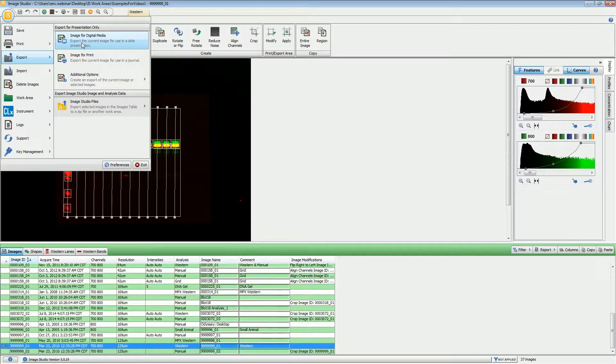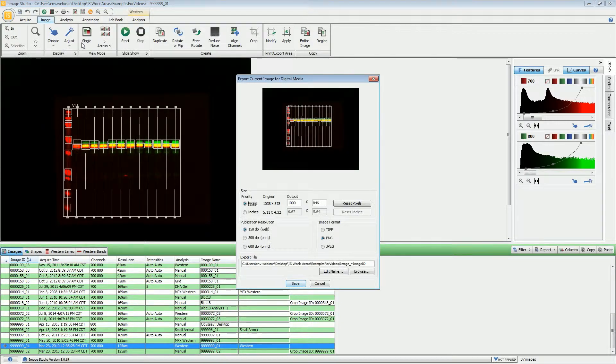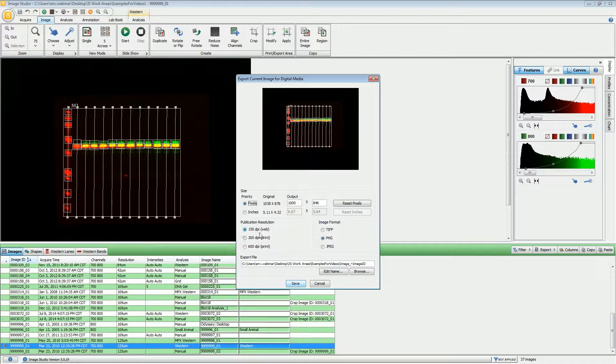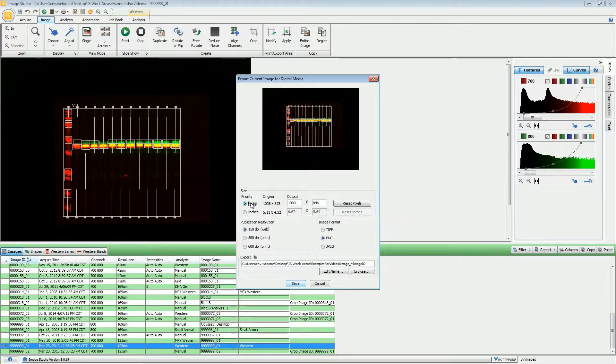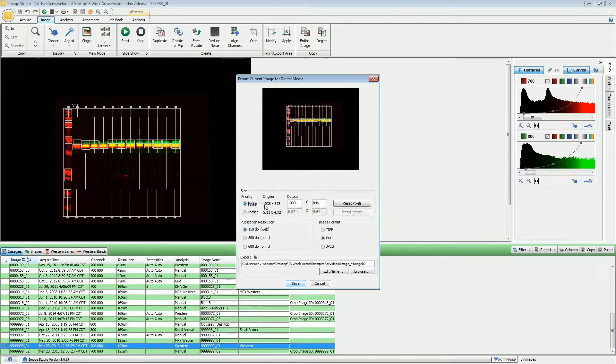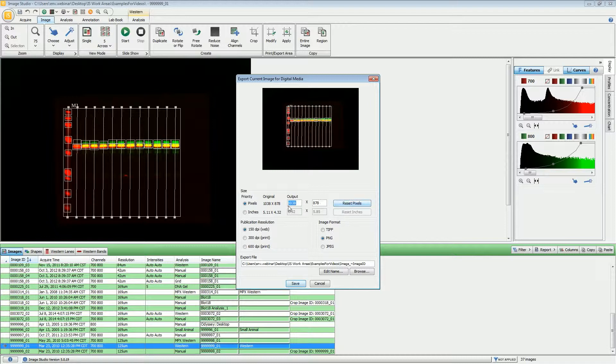The first option is for digital media. By default, it has 150 DPI, which is appropriate for web or digital presentation. Normally, you want to leave this set to pixels and have it set to the original number of pixels. If you just click Reset Pixels, it will do that.